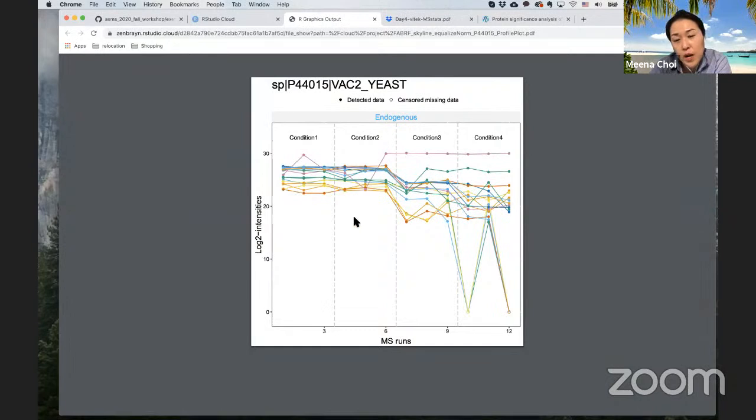Why this is important is to see if there are any features that have some issues or some really weird pattern. For example, here, quite parallel across the features, but this specific feature goes up and down, and they behave quite differently. In such cases, you might go back to your processing tool and double check what's going on. Maybe there are some parameters you can change, or you can remove this one, and so on. I just want to give you some idea about the data set itself.